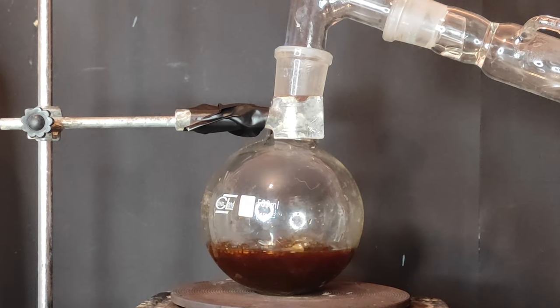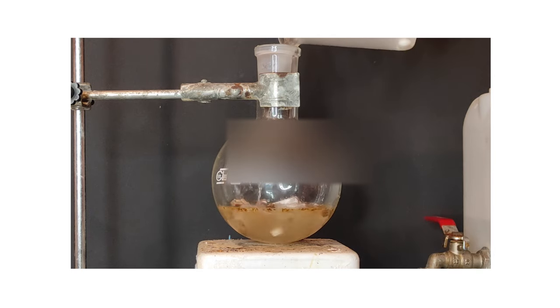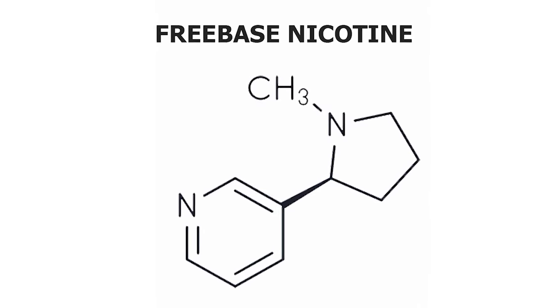As the tobacco is distilling, this is what's happening. When the sodium hydroxide was added to the cigarettes, it started freebasing the nicotine. Freebased nicotine is a liquid, which means it can be steam distilled.